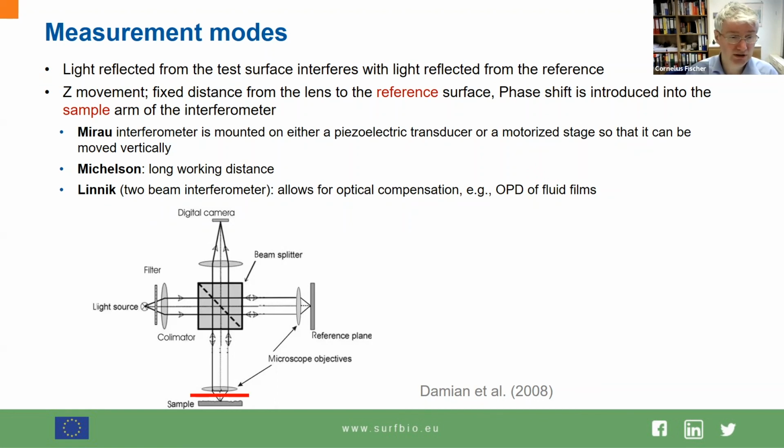So if you put in something on top of your sample, an example would be the fluid film in a fluid chamber, you can do identical things with your reference objective, and you correct automatically for the modification, similar to a filter system that you apply to both beam pathways.